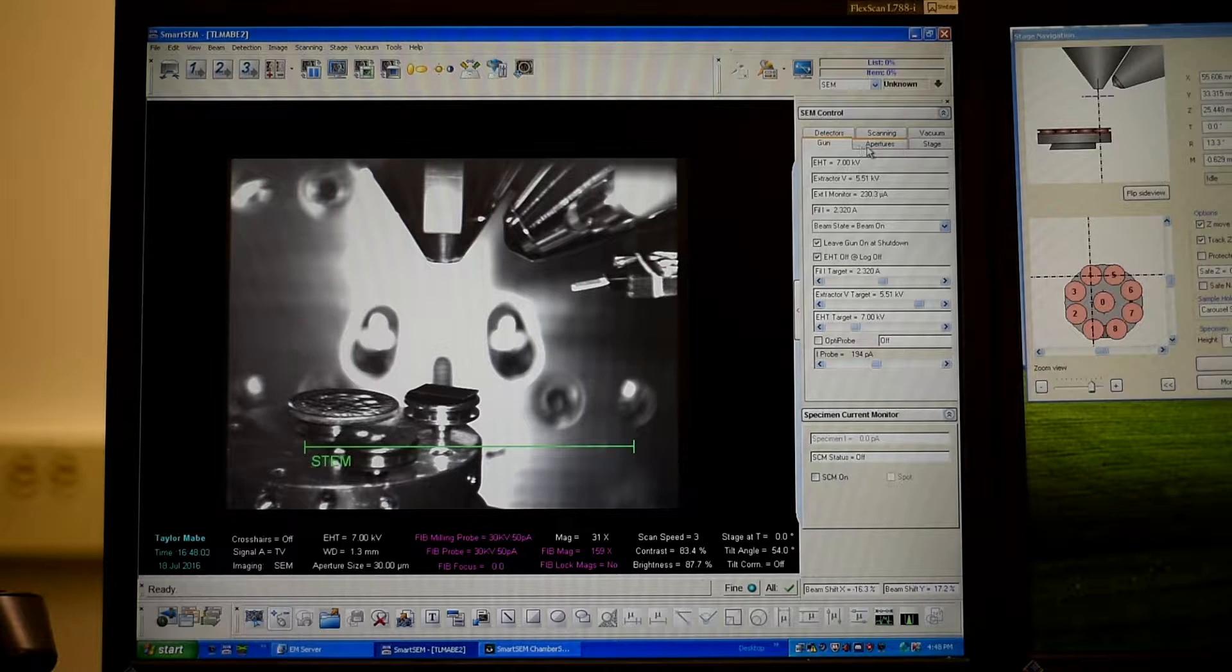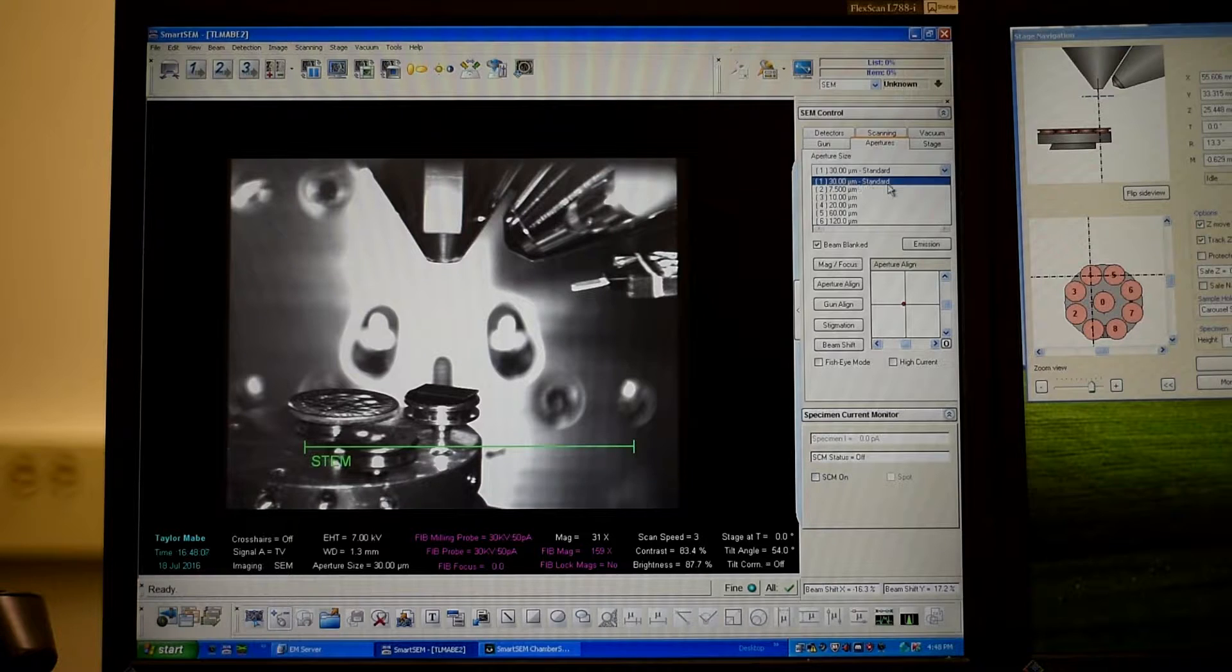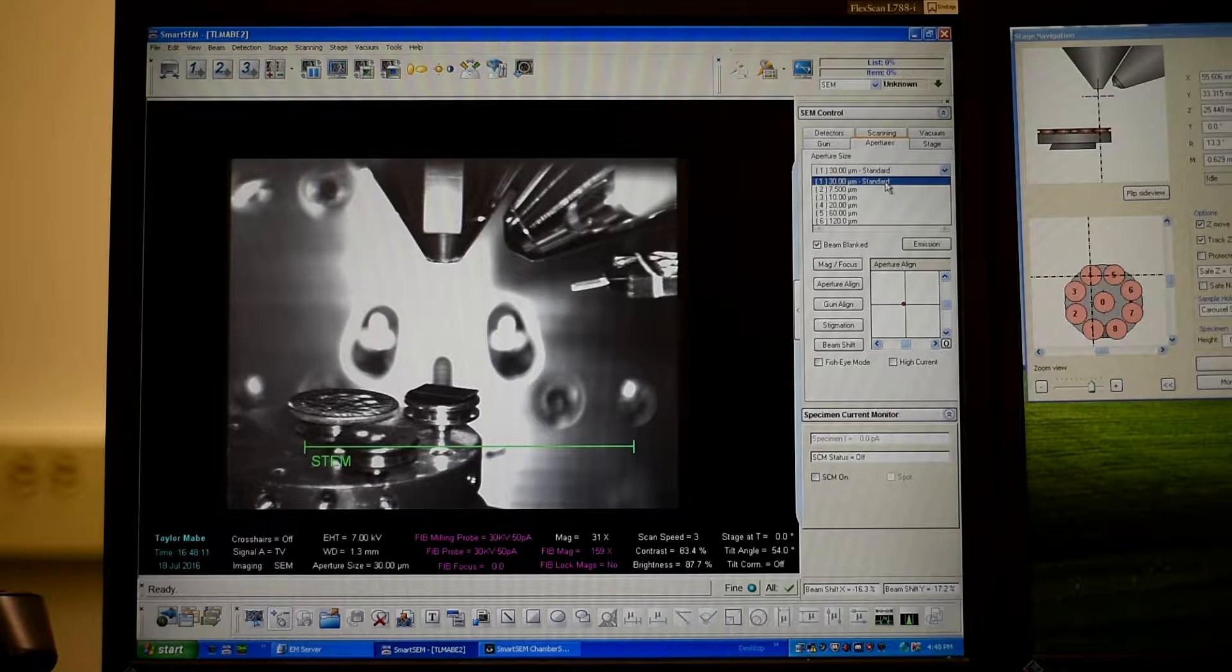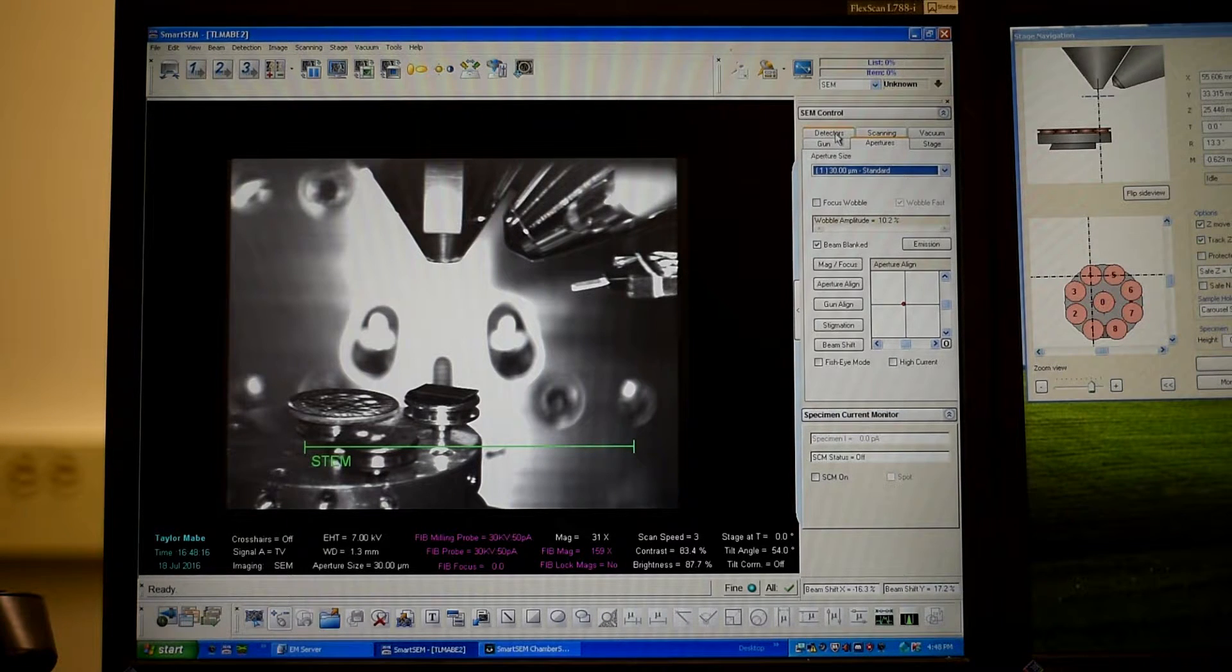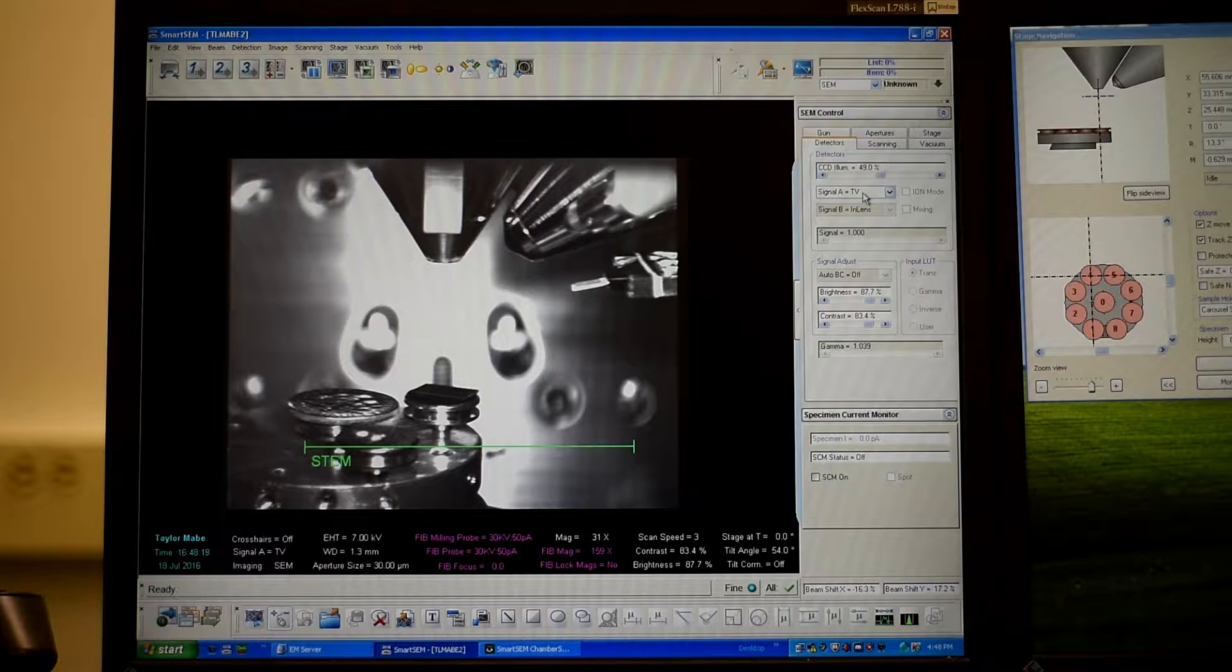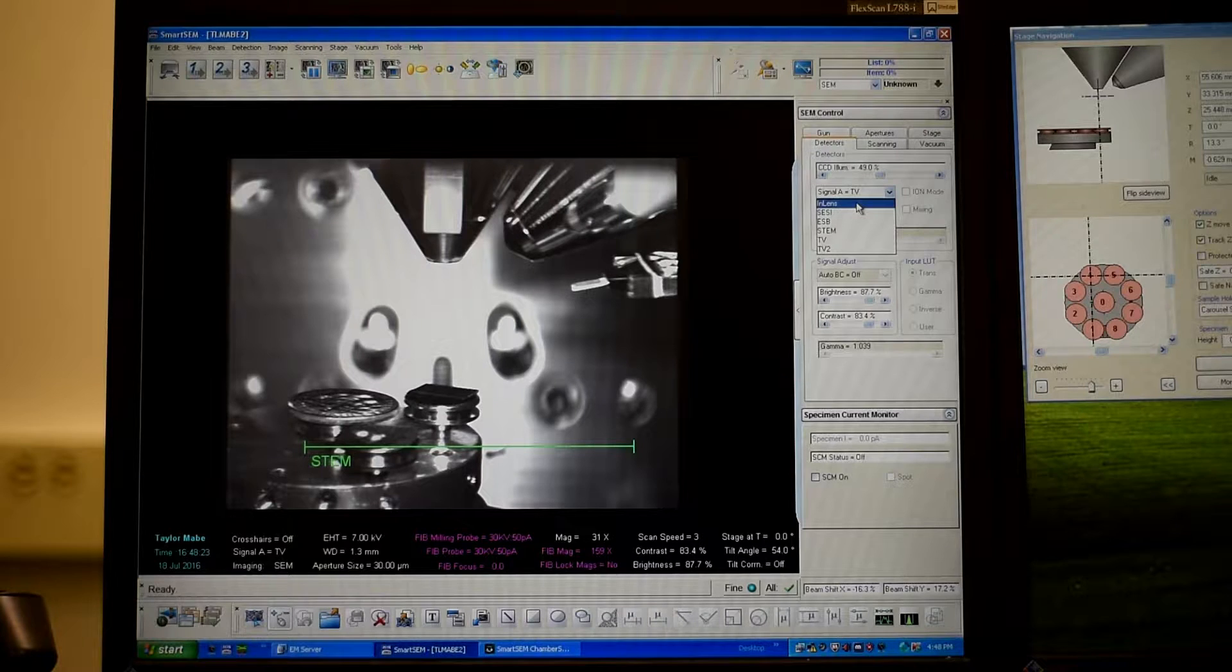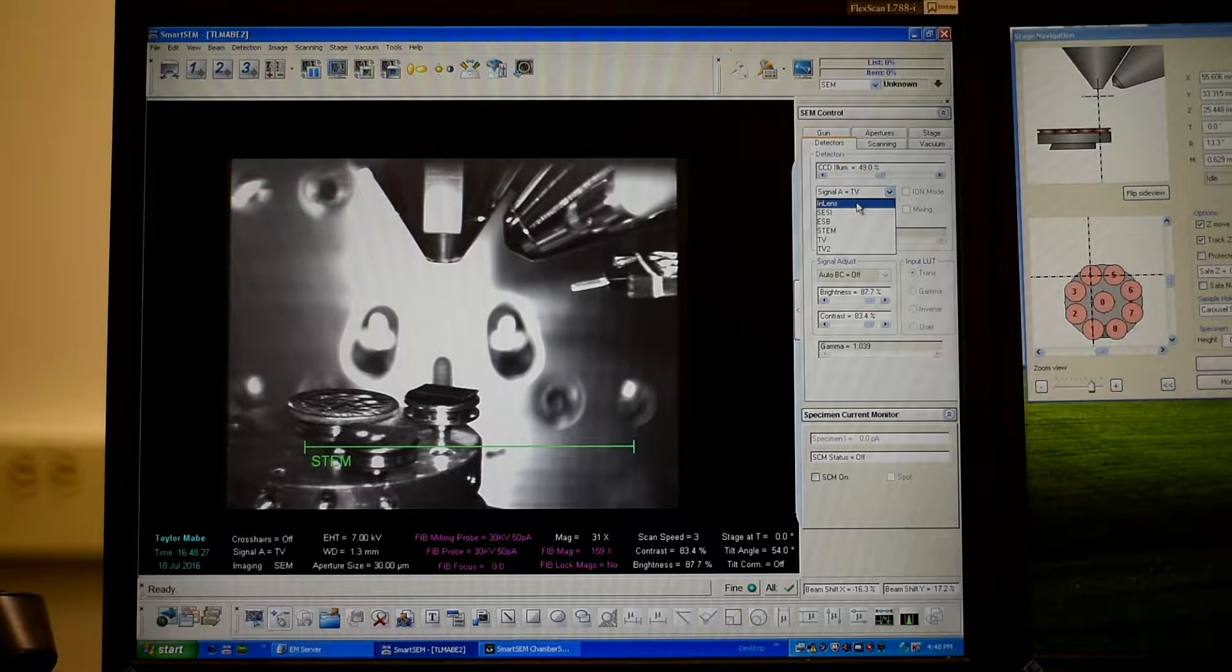So typically, people for SEM just use the standard 30 micrometer aperture. So the larger the aperture, the more electrons you're going to get through. So for this, we'll just use the standard. And then the detectors, right now we're on the TV monitor where people generally like the in-lens for things, say, 7 millimeter working distance and less.